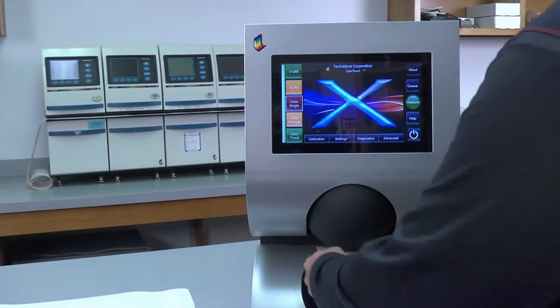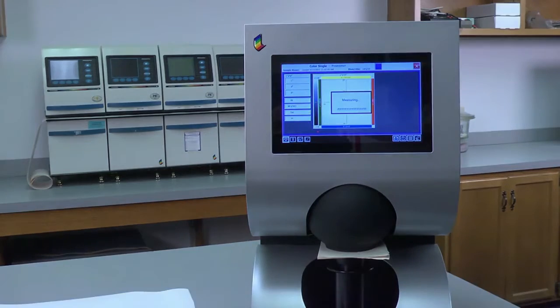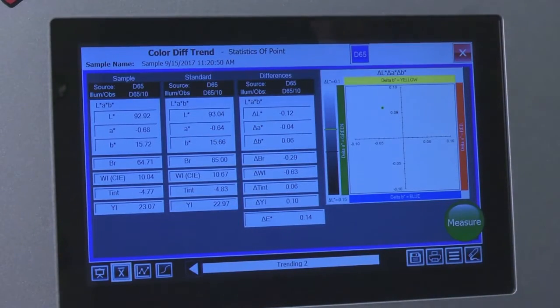The expanded wavelength range of this new instrument provides a higher level of accuracy and capabilities. As the newest member of the ISO family, the Color Touch X is the most advanced touchscreen color spectrophotometer available anywhere.